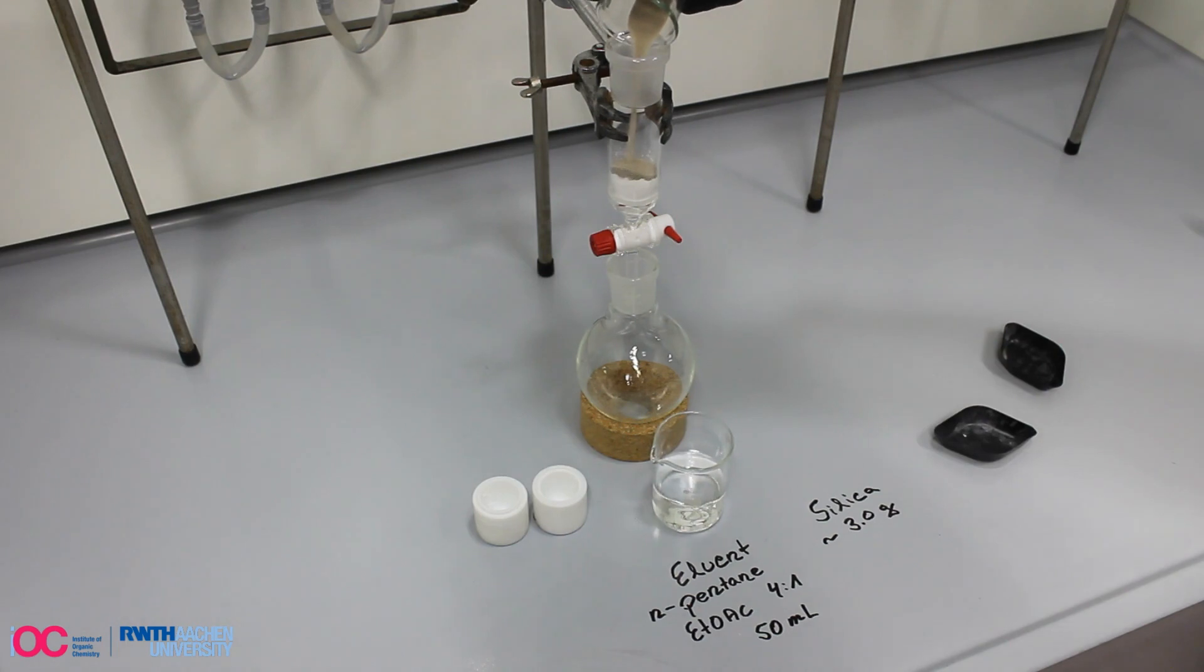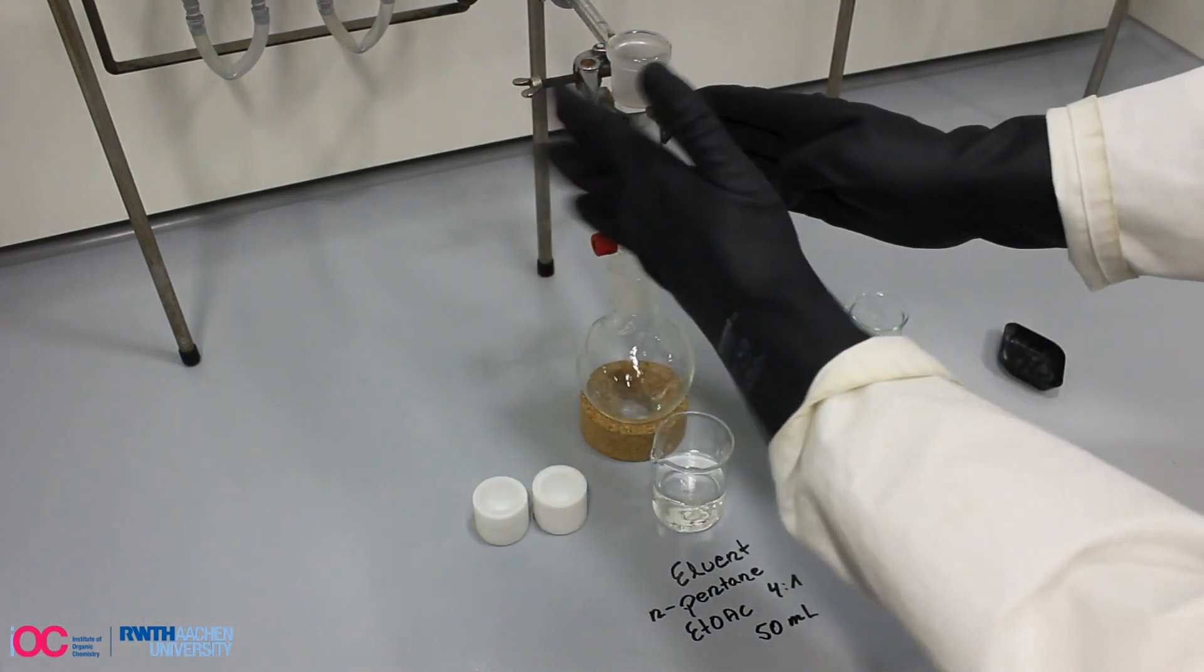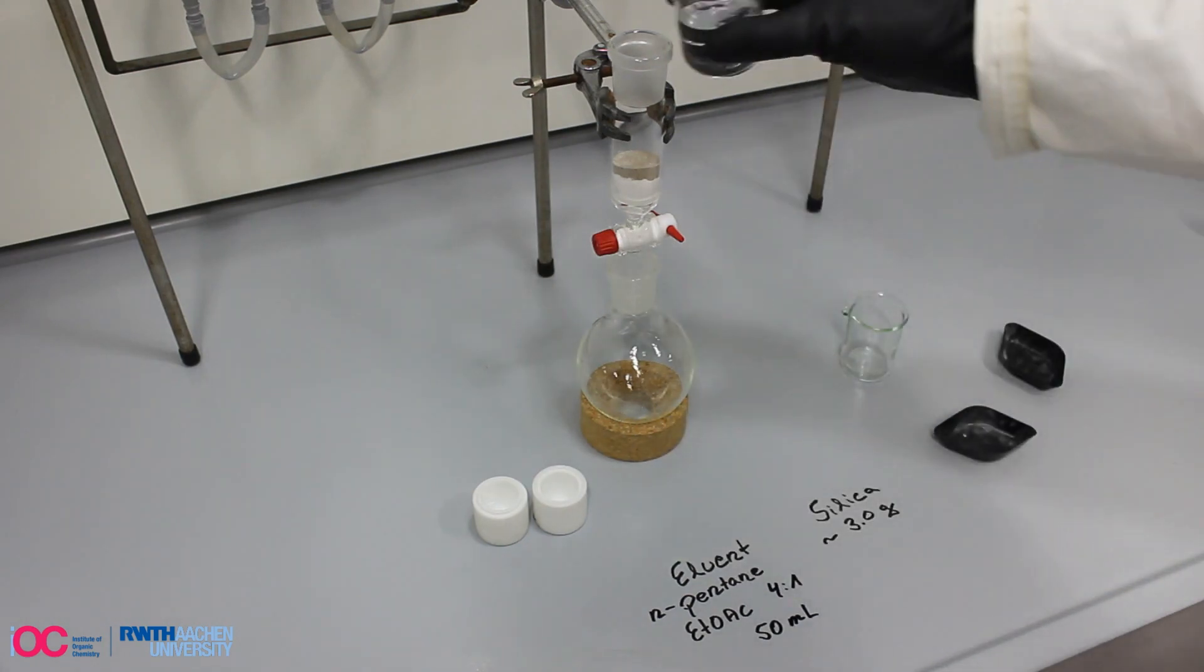Then, the plug was rinsed with approximately 50 ml of the appropriate eluent, in this case a 4 to 1 mixture of n-pentane and ethyl acetate.